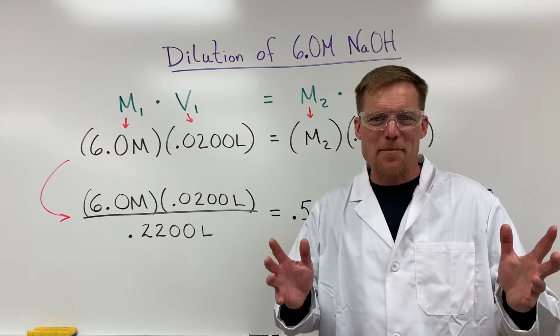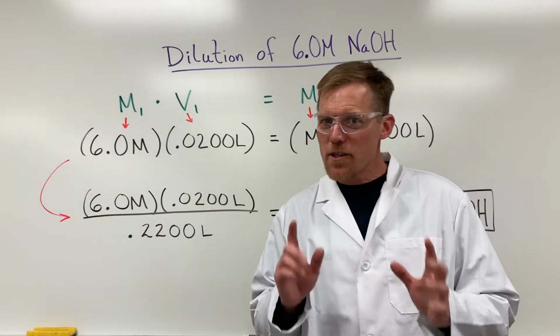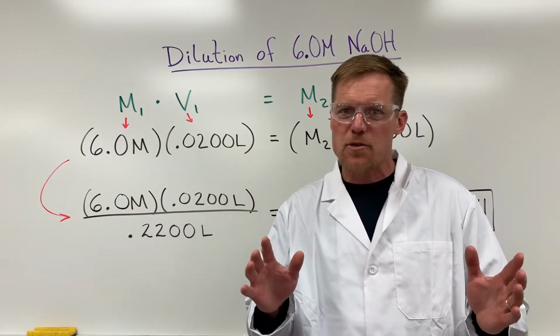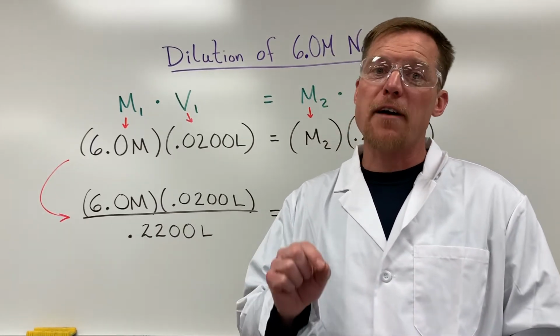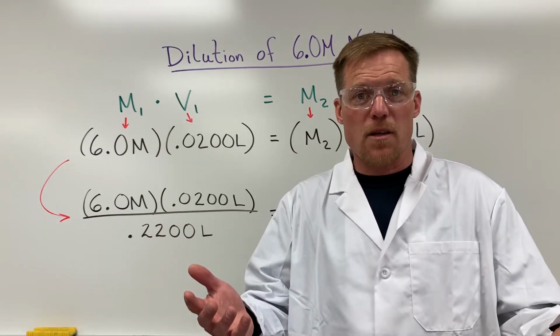All right, I'm super excited about today's lab. We are going to be doing a titration. What's a little bit different about our lab that we do in class compared to other titration labs you might see online is we actually create the base that we're going to find the concentration for. We're going to do essentially a dilution, all right?